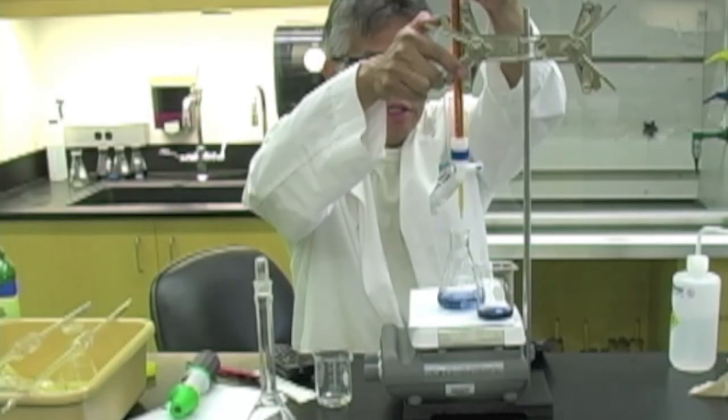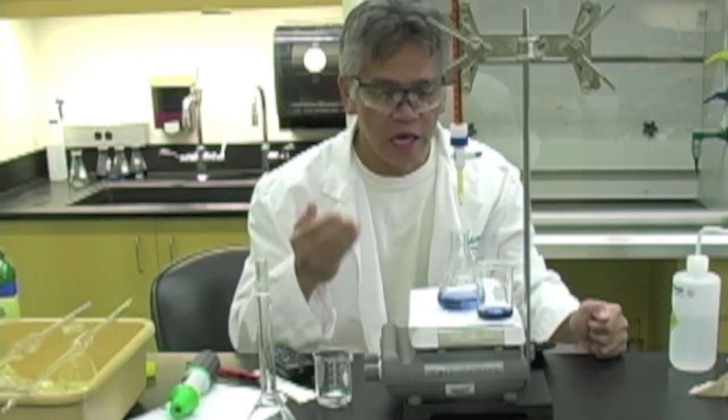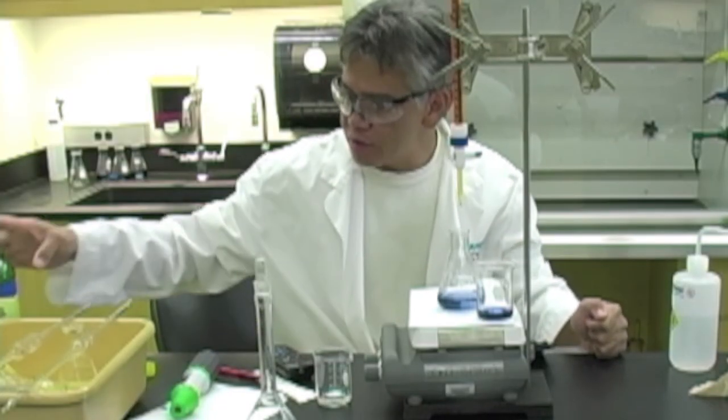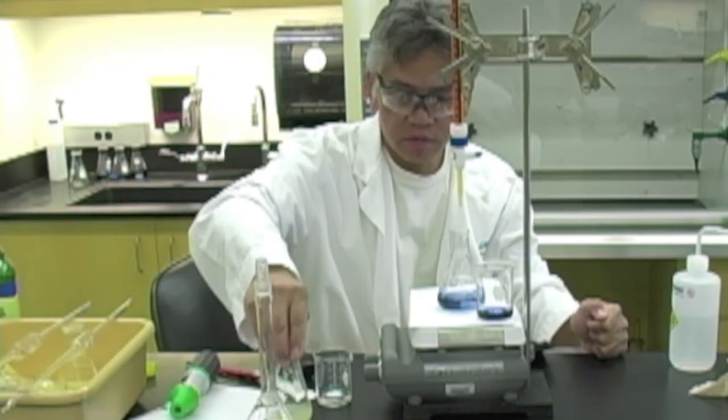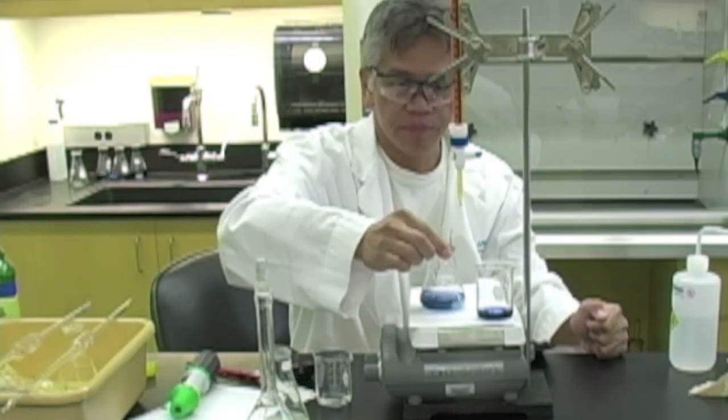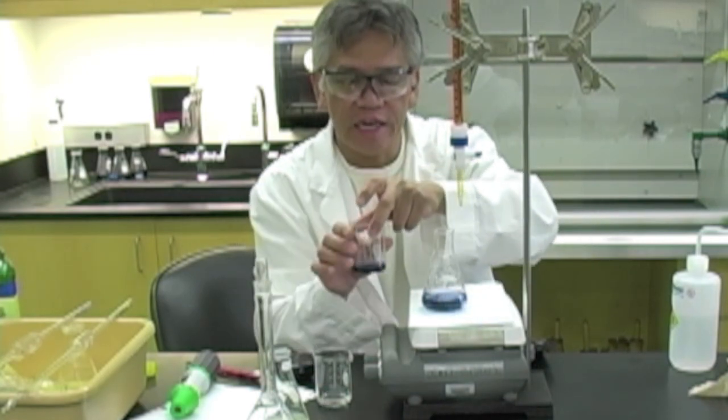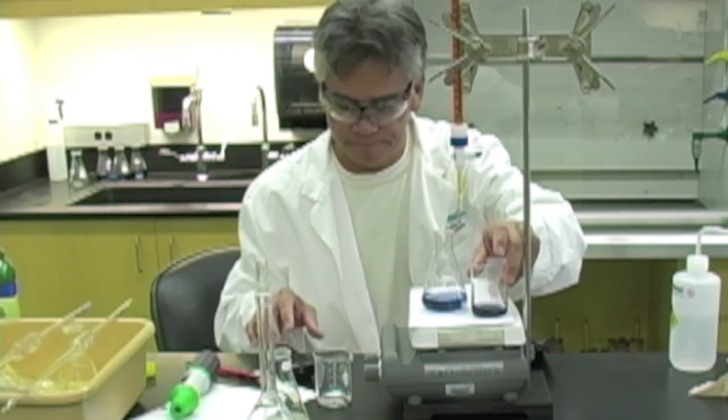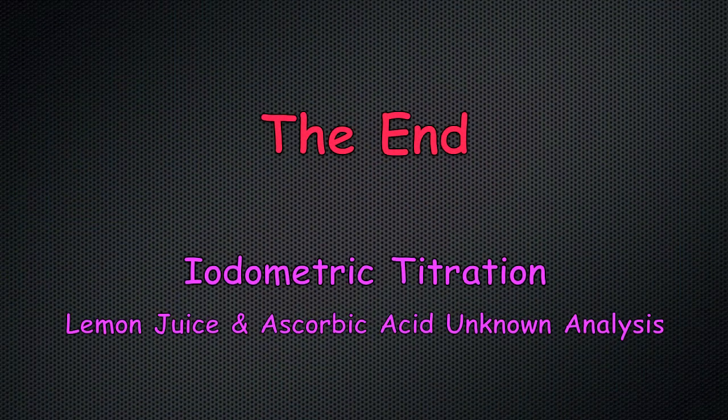This is the technique you would use to titrate ascorbic acid. First the lemon juice, known solution, and then your unknown. The endpoints were different for the two samples and it always helps to do a pre-titration to get an idea of what the endpoint looks like.